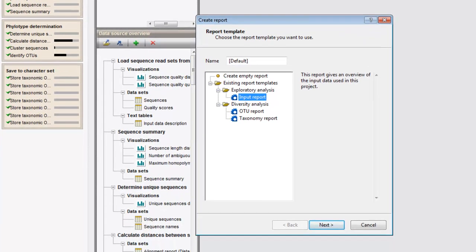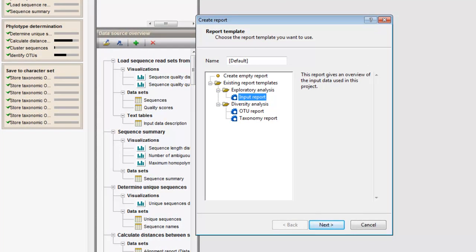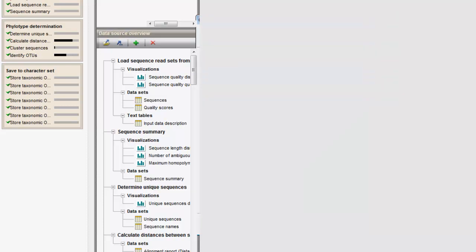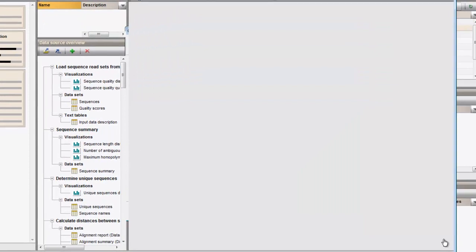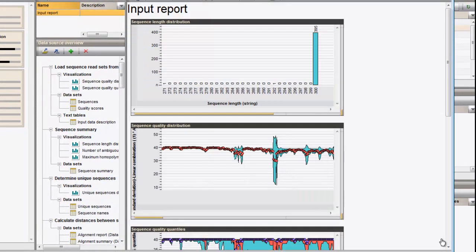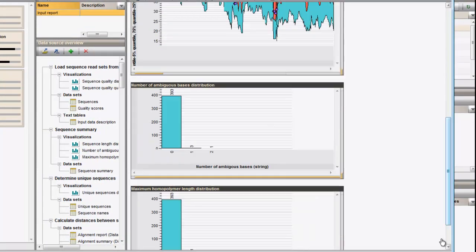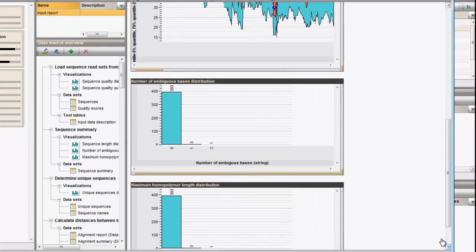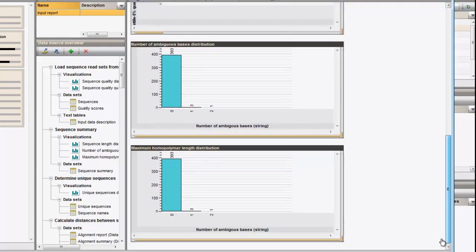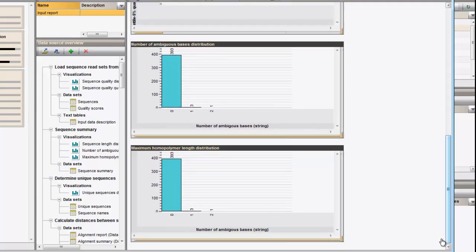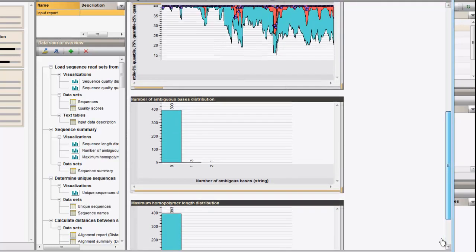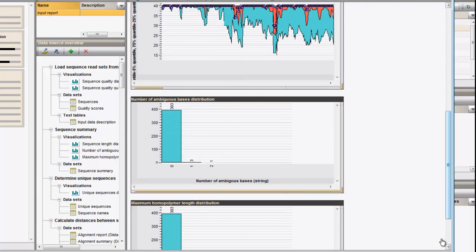As a start, we will create the input report for the current dataset. The input report displays charts on sequence length, sequence quality, the number of ambiguous bases in the reads and the maximum homopolymer length.